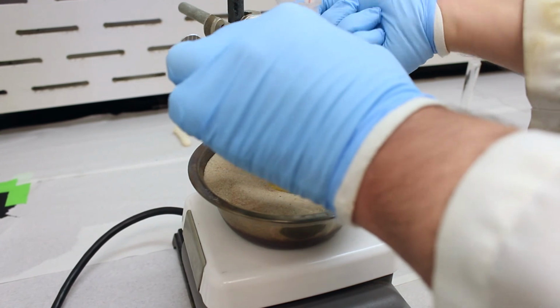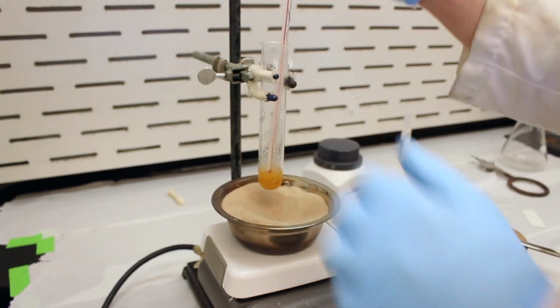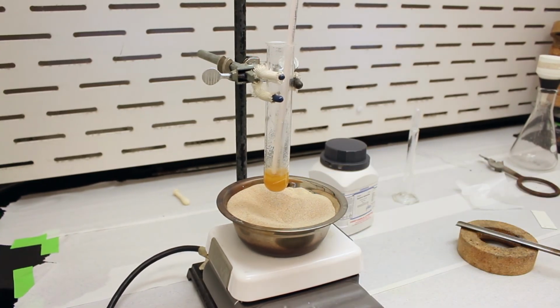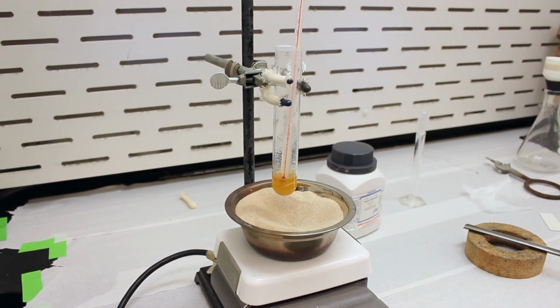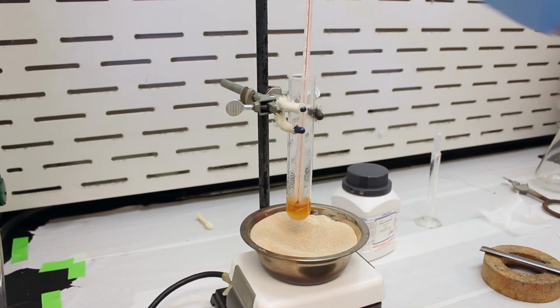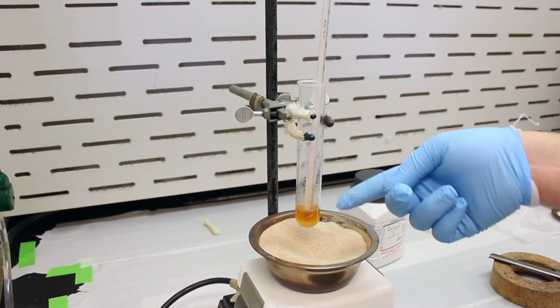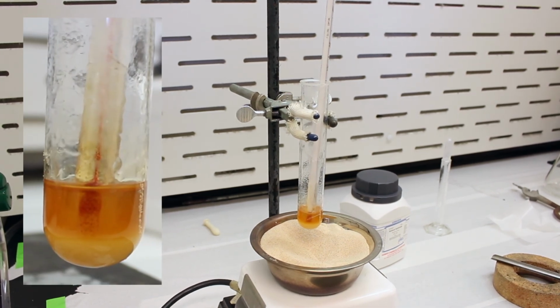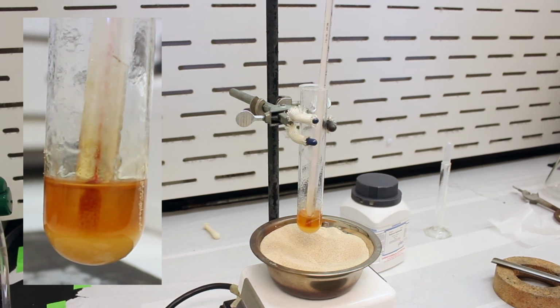So what we're going to do is raise our test tube out of the sand bath. We've stopped applying heat, and our product should be in solution here. You can see it's still kind of boiling there. The goal now is to isolate the product by precipitating it with some water. The problem with that is if we add water to it right now, we could crack the flask. This vessel is at very high temperature, so we're going to have to let it cool to room temperature for a little bit. Then we'll add some water, which should precipitate the product, and then we can recrystallize it from there.